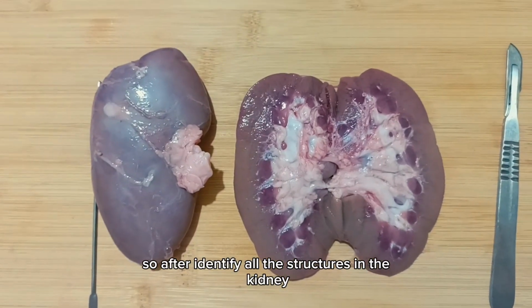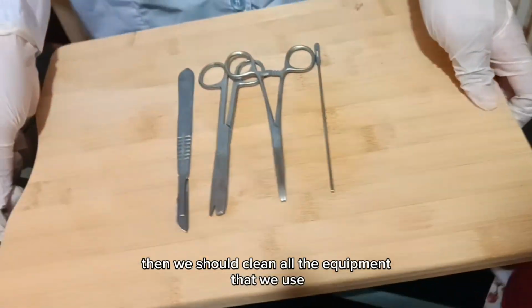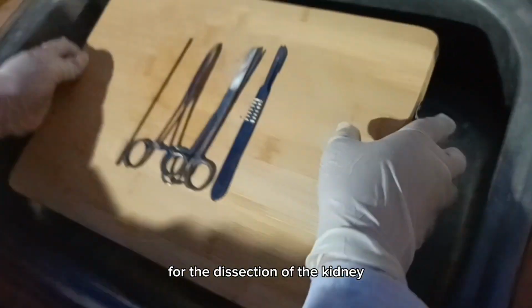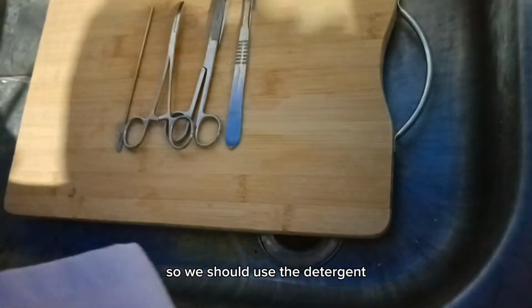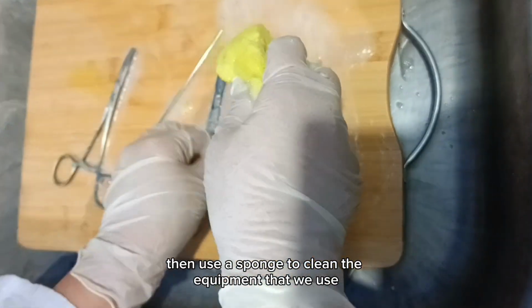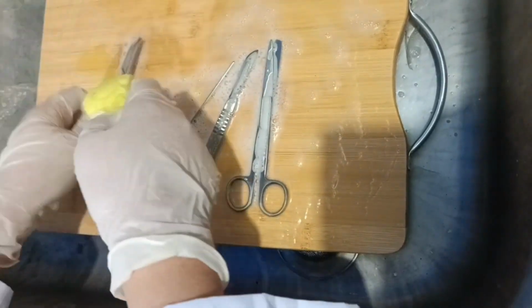After identifying all the structures in the kidney, we should clean all the equipment that we used for dissection of the kidney. We should use detergent on the equipment, then use a sponge to clean the equipment that we used.